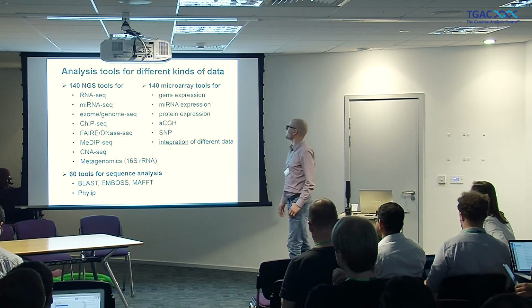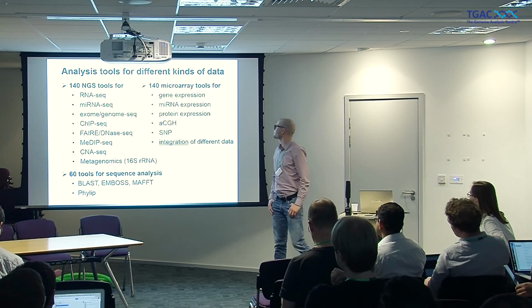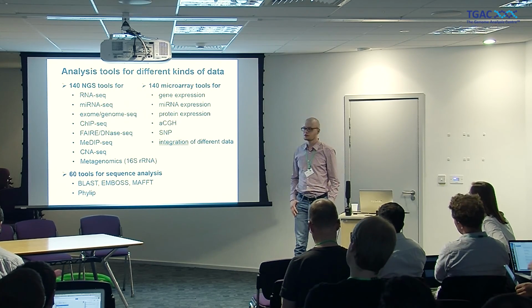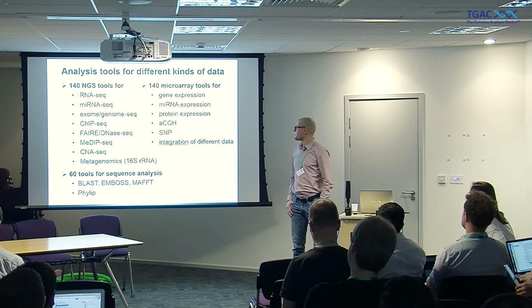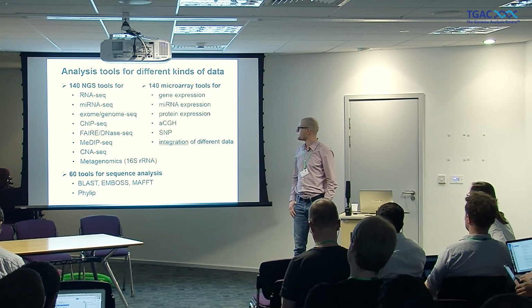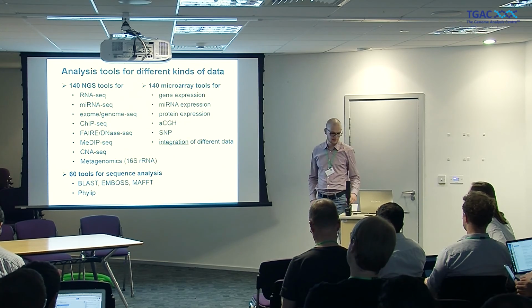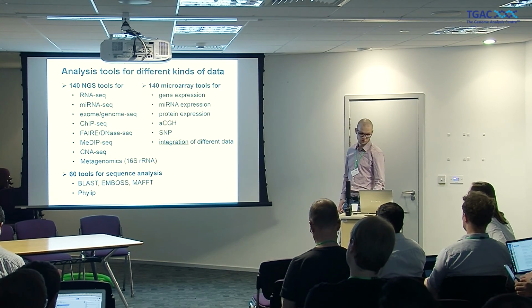There are 140 microarray tools, many of them based on Bioconductor, the same amount of NGS tools, and then a little bit for the sequence analysis also. Sorry, forgot to introduce myself, I guess so.